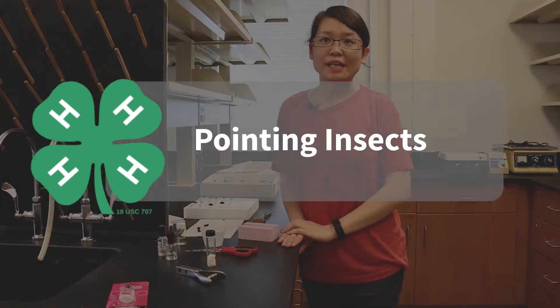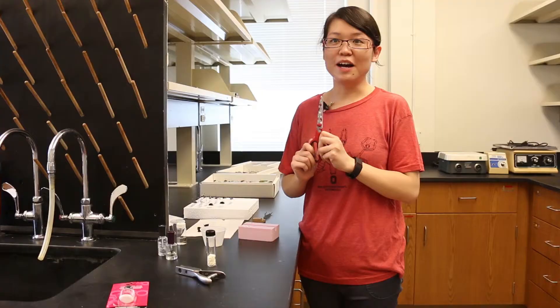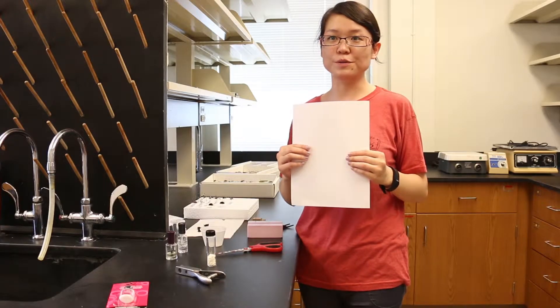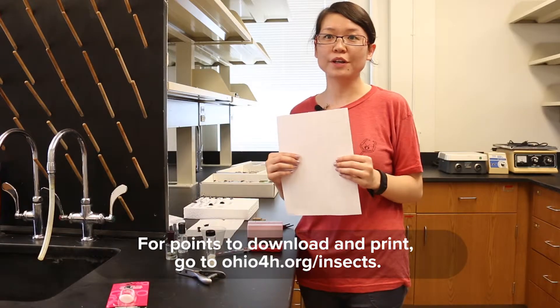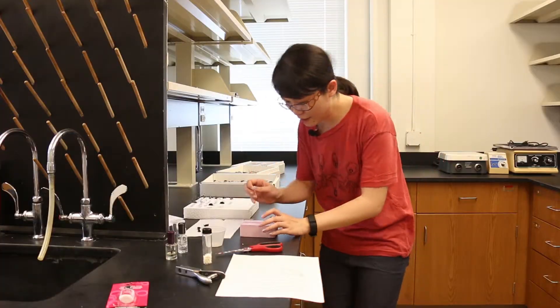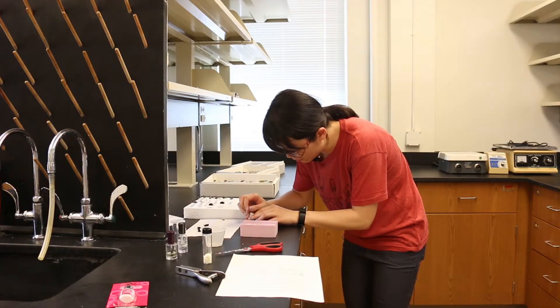Second is pointing insects. For insects that are too small to pin, we point them. The tools we need are white paper, scissors, clear nail polish, insect pins, and pointers. First, we cut a bunch of triangles out of paper — you should have a page in the back of your 4-H Collect notebook where you can cut out triangle points. After you have some points, take an insect pin and push it through the wide end of the triangle, then push through the hole on the pinning block.